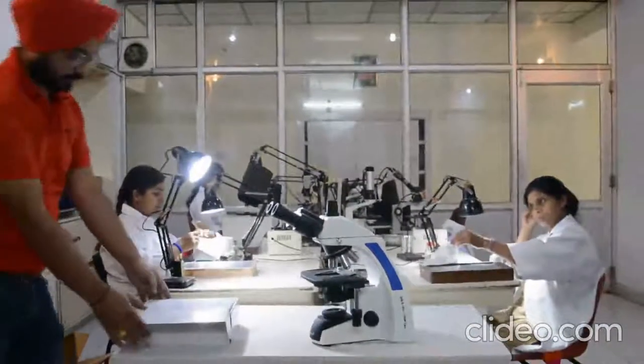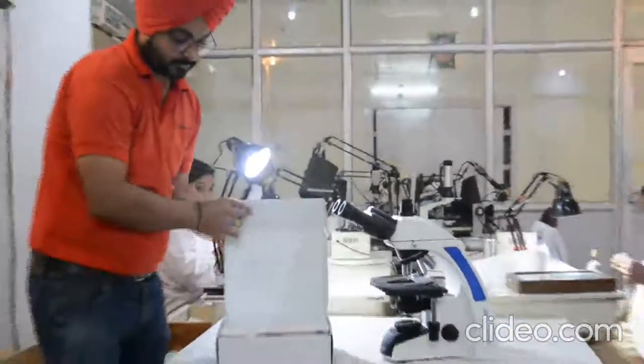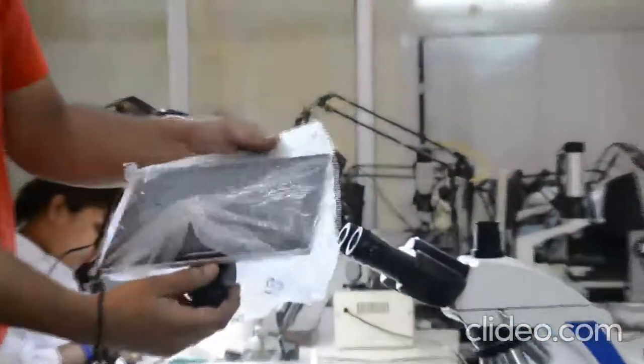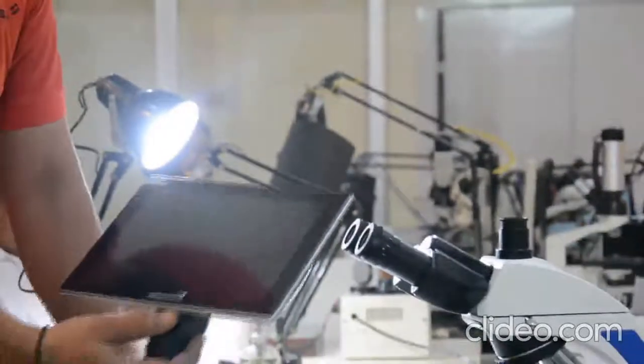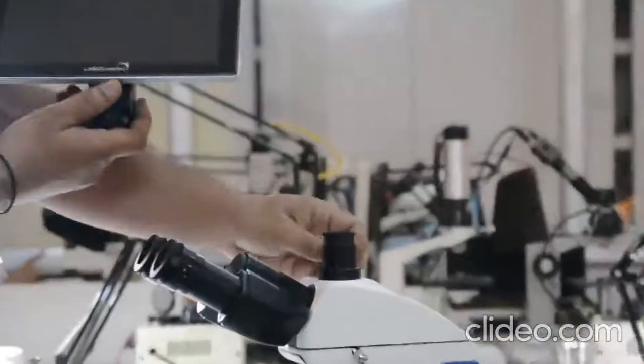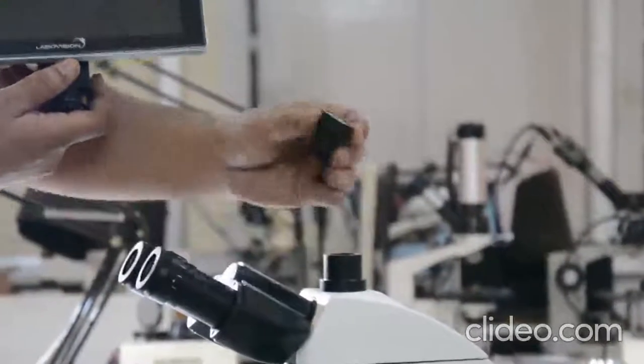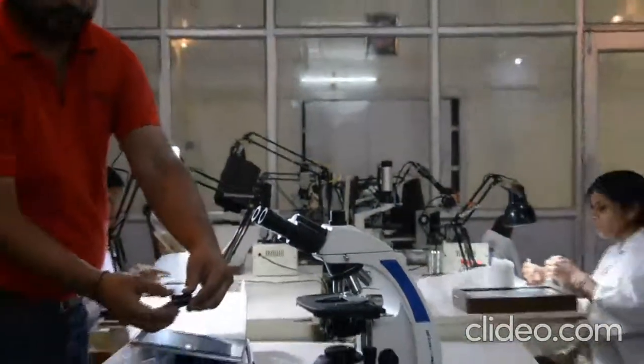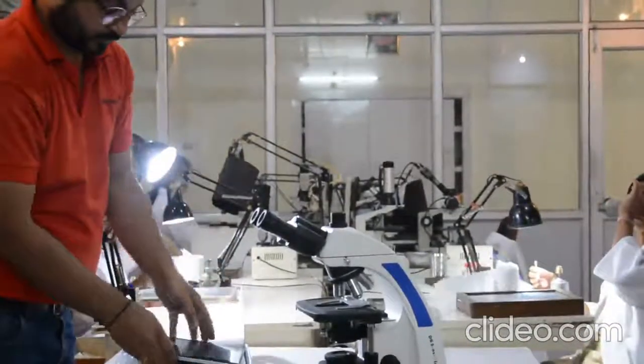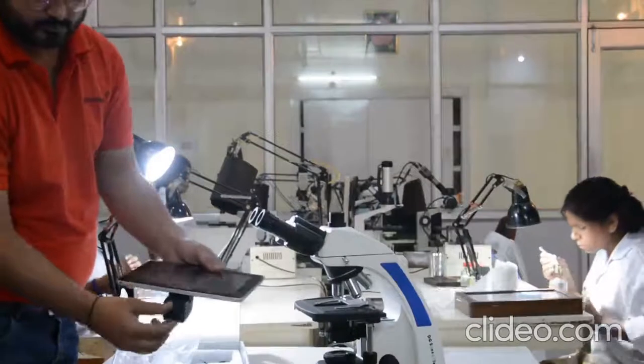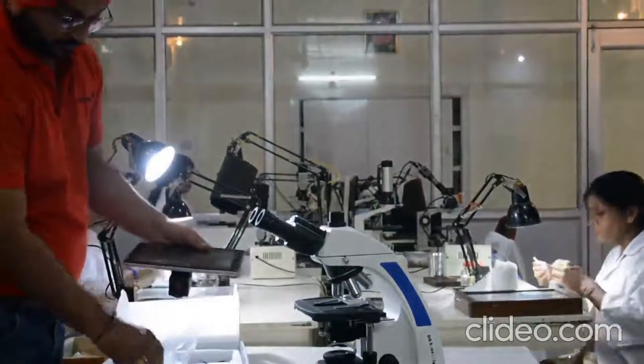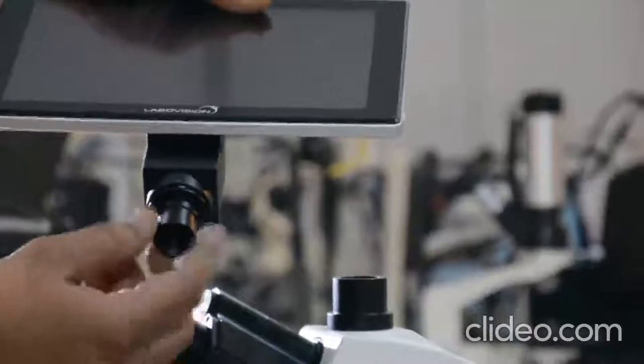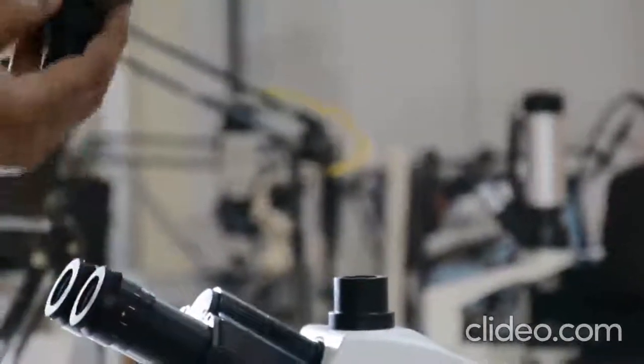Now we will unbox the LCD screen. We will place it on the trinocular port which is there on the head. Then you have to remove the cover. Remove the bottom cover of the LCD screen. Put back the attachment. Screw the attachment so that it fixes on the trinocular port.